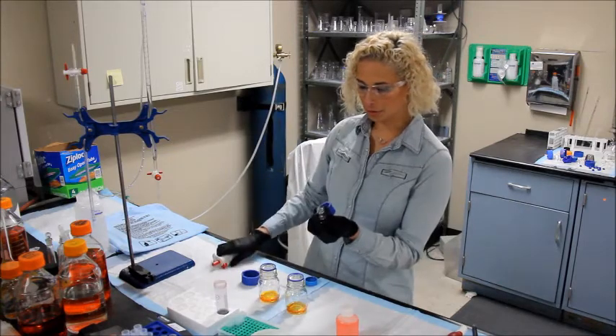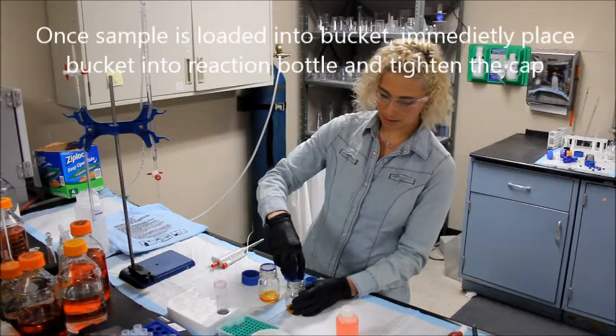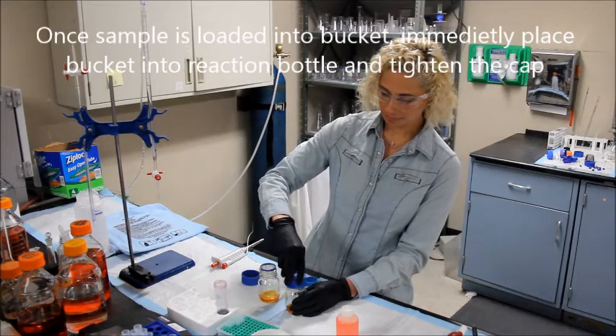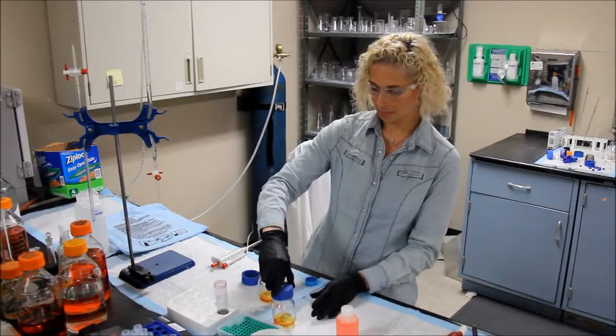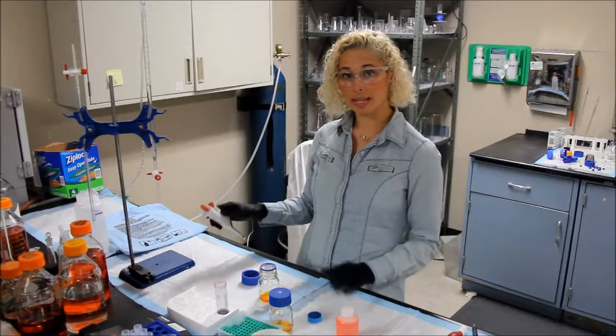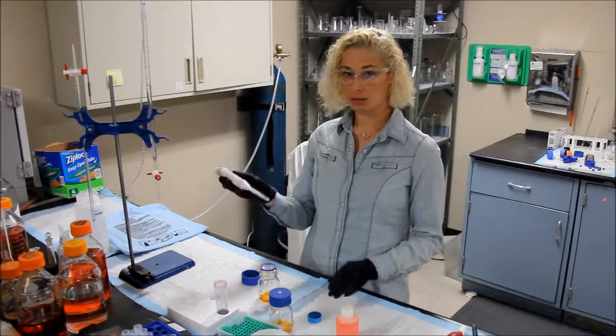Once you load your sample into the bucket, immediately place the bucket into the reaction bottle and securely close the lid. Now do the same procedure — same pipetting technique — with your blank sample. Use a fresh tip.